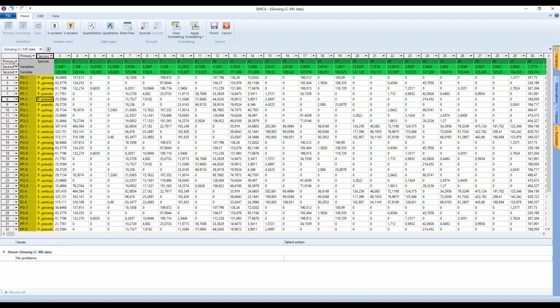Okay, your primary variable has to be unique, and you assign it here. In our case, LCMS, the raw data that you generate in that matrix that I just showed you previously, these variables are not unique. The retention time will be repeated the moment we have a different mass charge that occurs at that retention time.